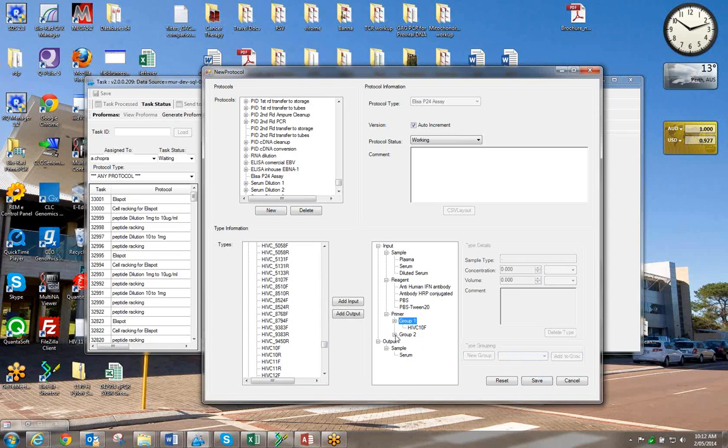Okay, so now you'll see these group 1 and group 2, so you can separate them out. If you've got multiple different primers that you could use in the PCR and you would just want to choose only one pair from each, that's how you would do it. But in this case, I'm just going to remove it because we don't need any primers. That was just an example.